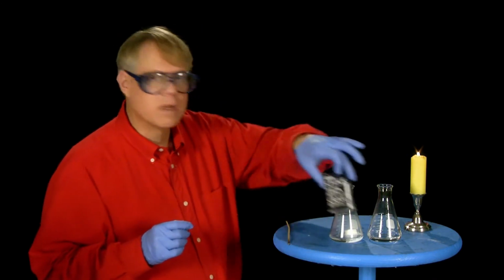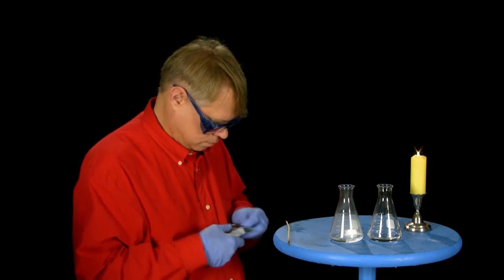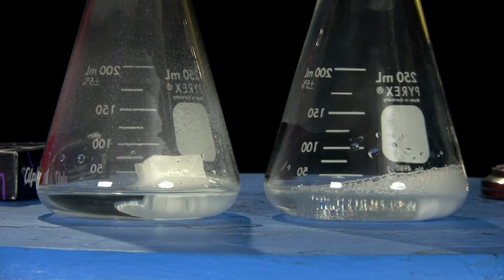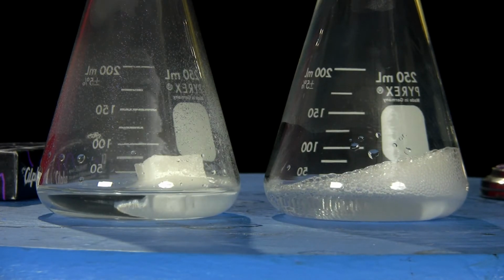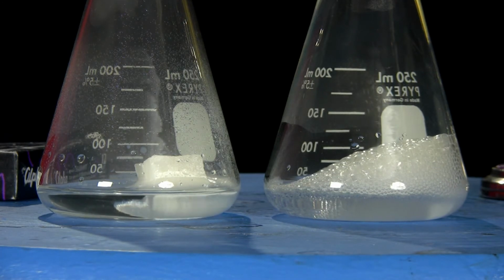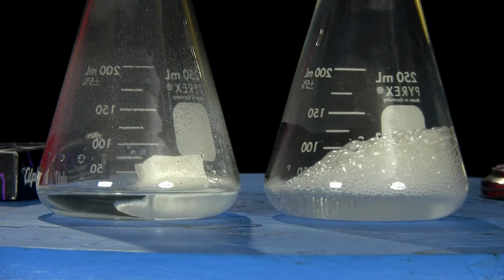We also find that this gas is not merely contained in marble. Here is some common chalk, and in this flask, more hydrochloric acid. It too evolves carbon dioxide, exactly the same in its nature and properties as the gas we obtain from the combustion of the candle in the atmosphere. And no matter how different the methods, from marble or chalk or candle, by which we prepare this carbon dioxide, you will see when we get to the end of our subject that it is all exactly the same, whether prepared in the one way or another. We will now proceed to the next experiment with regard to carbon dioxide.